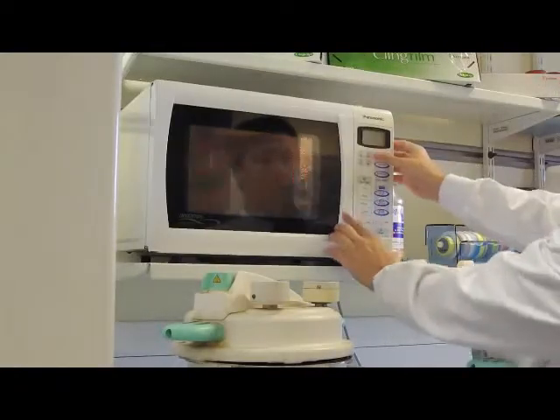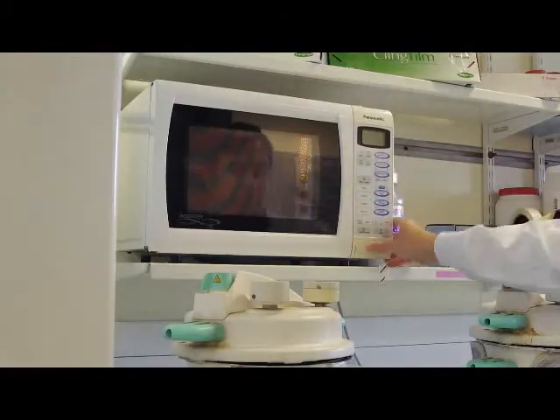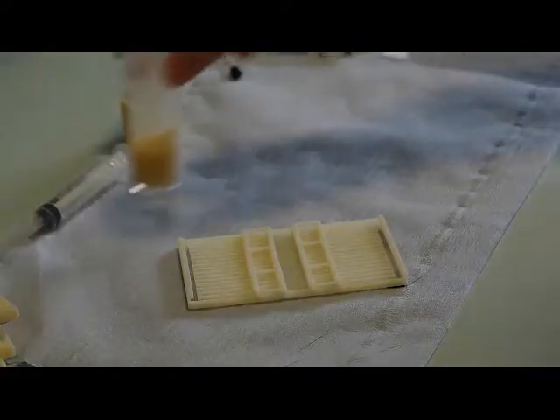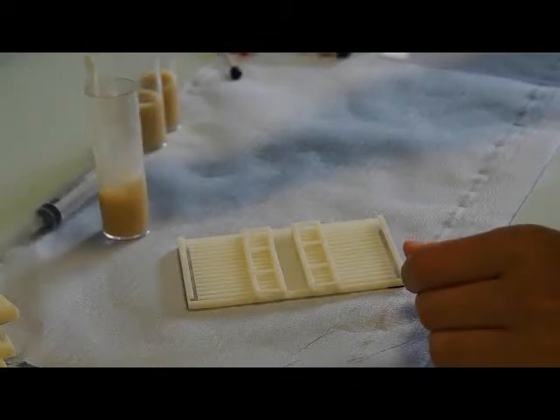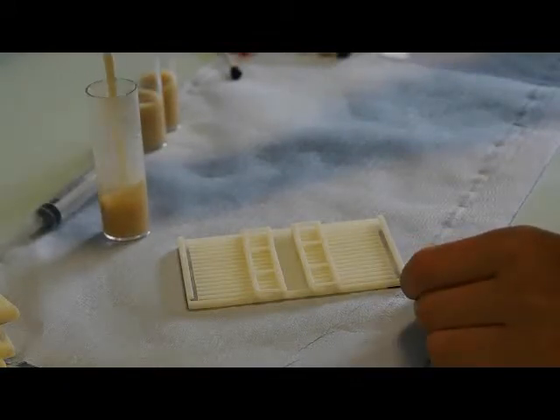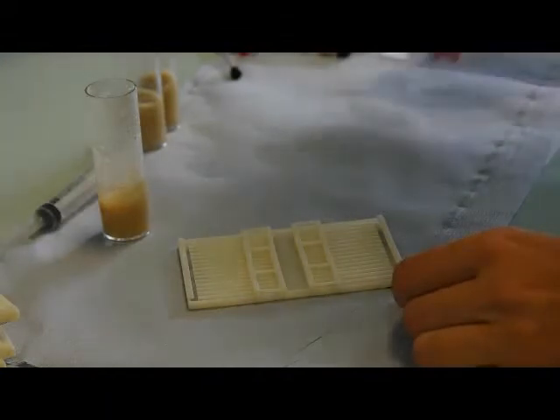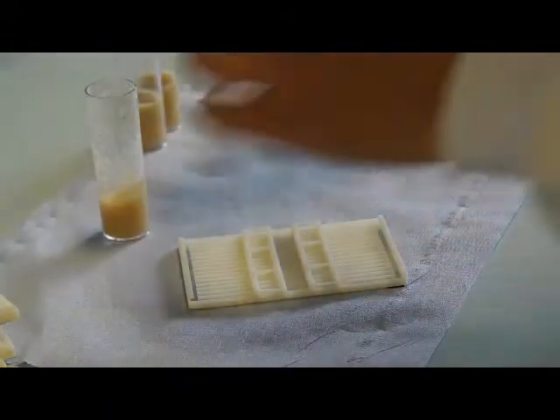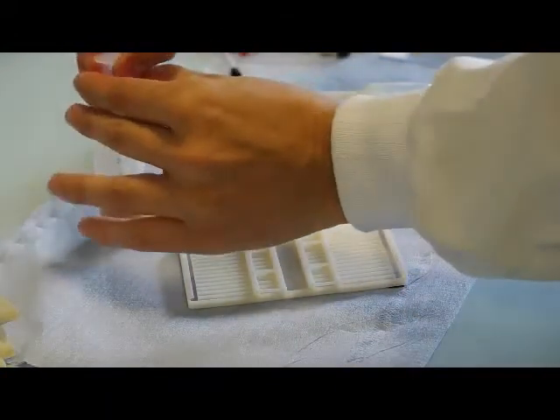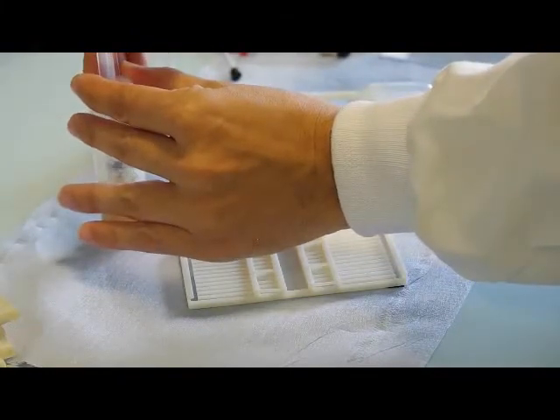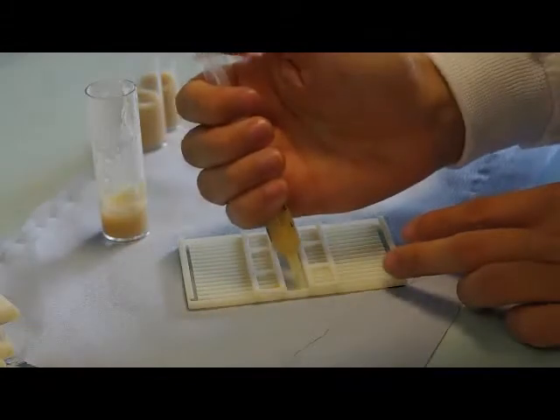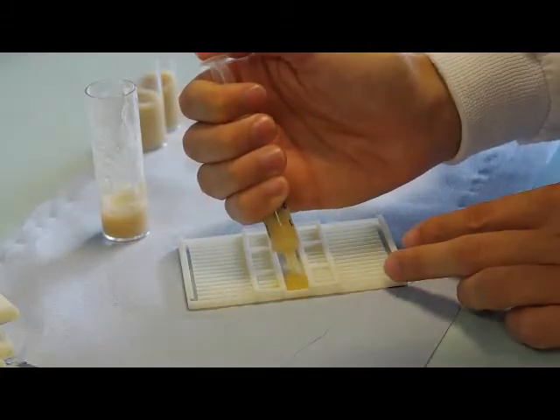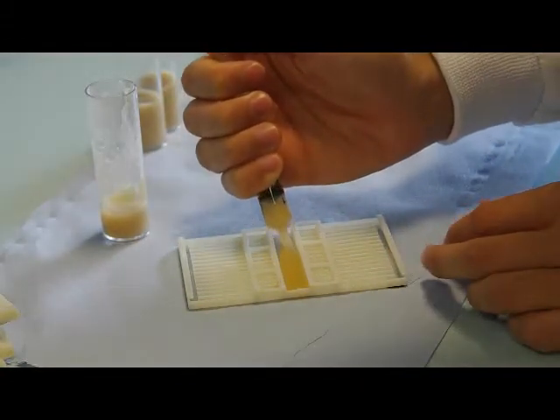Take a regular vial and microwave it for 5 to 10 seconds, or until the food melts. Gently stir the melted food to make sure it's homogeneous. Pour the food into the chamber using a 5ml syringe. Make sure you fill up to the right level, and try not to make too many air bubbles.